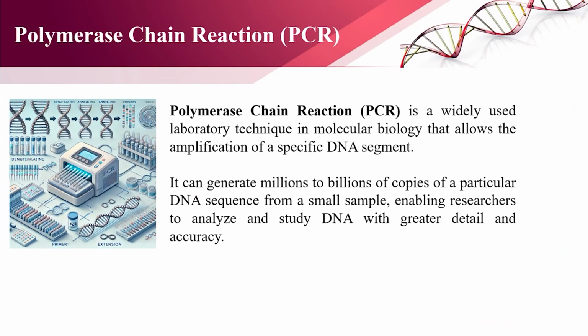So basically, what is polymerase chain reaction? Polymerase chain reaction is a widely used laboratory technique in molecular biology that allows the amplification of specific DNA segments. It can generate millions to billions of copies of a particular DNA sequence from a small sample, enabling researchers to analyze and study DNA with greater detail and accuracy.